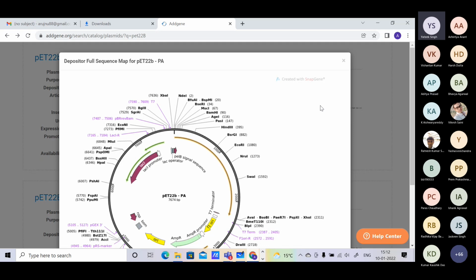What does it reflect? It shows the number of cells in the sample. Why are you using the word probably? Don't use words like probably or may. You have to be absolutely sure. Yes, it means the number of cells in your culture. One OD means 10 to the power 8 cells per ml of culture, right?